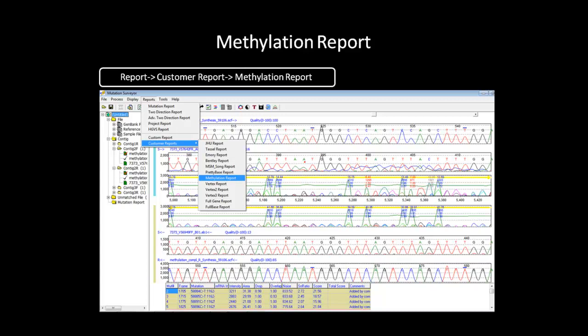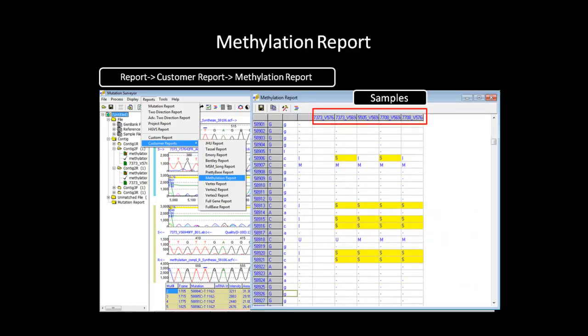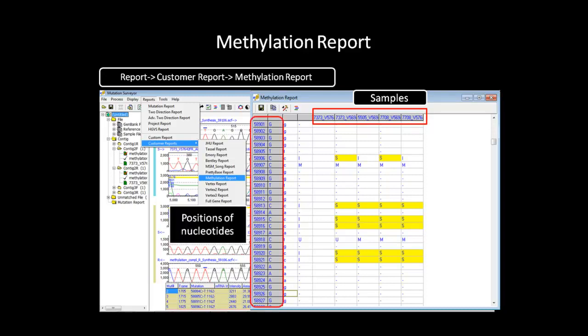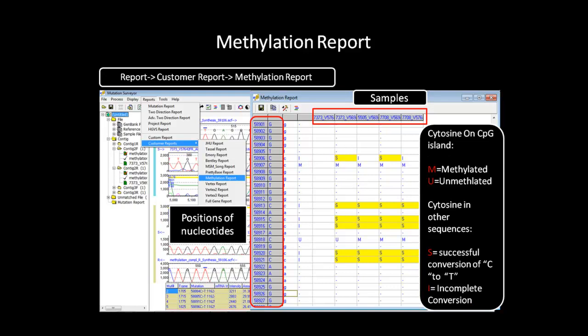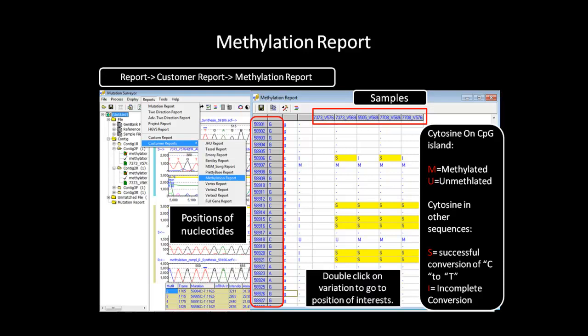You can see all the unmethylated and methylated sites by activating the methylation report under the report tab. The methylation report can be accessed by going to the report tab and selecting customer report. A group of reports will appear. Select methylation report to bring up the report table. Each individual sample's amplicons are displayed in the first row, and the position and nucleotides are displayed on the left-hand column. The report will have four-letter indications: M for methylated and U for unmethylated cytosines on the CpG island, and S for successfully converted and I for incomplete conversion for cytosines outside of the CpG island. You can double-click on any of the cells and the main analysis window will take you to the position of interest.